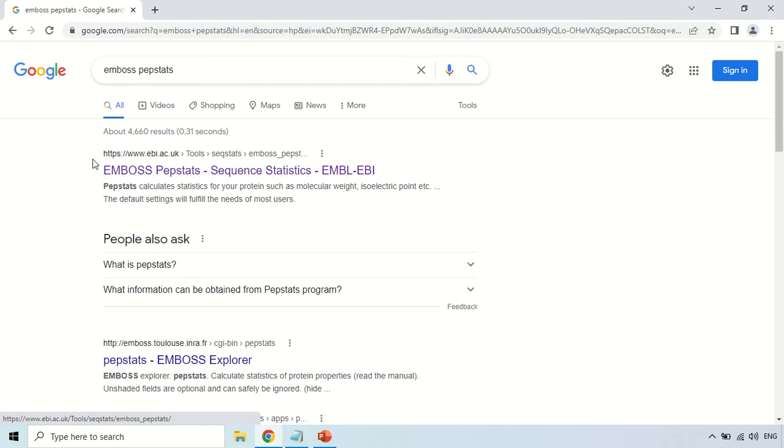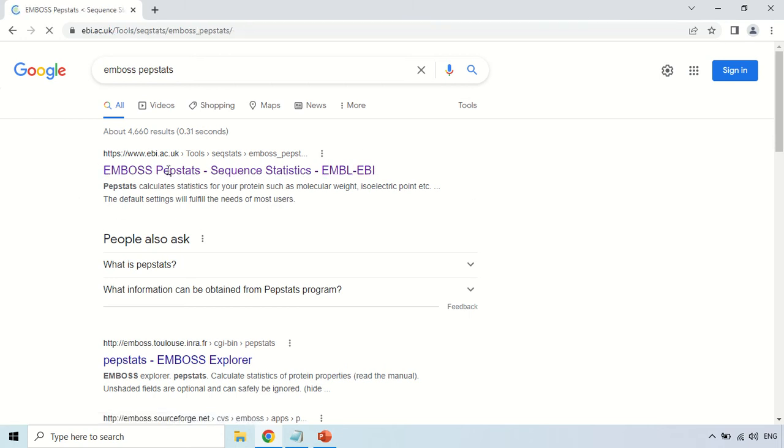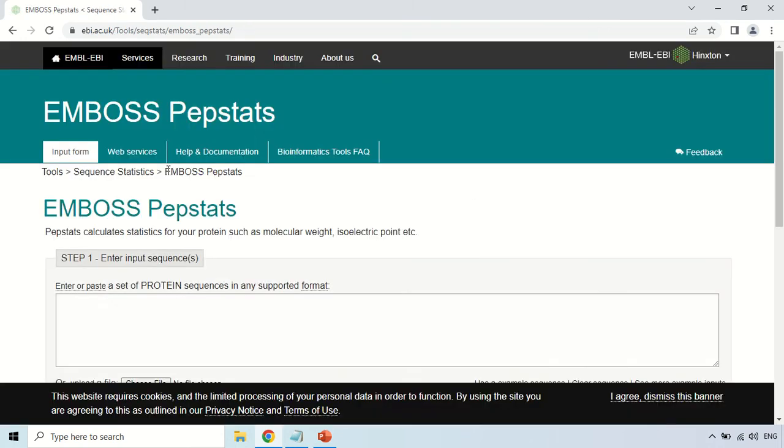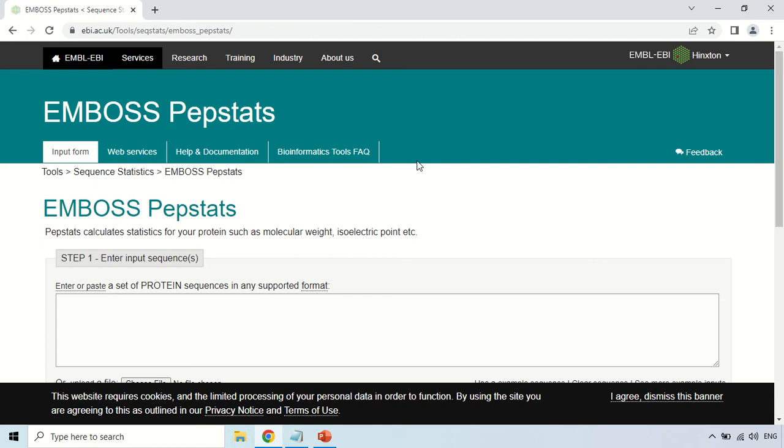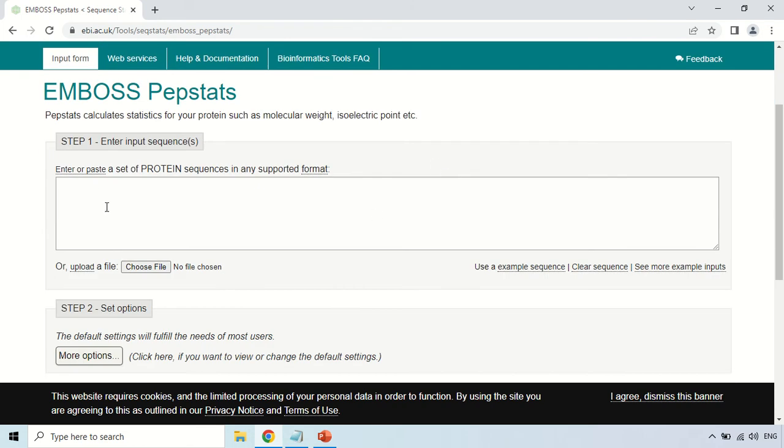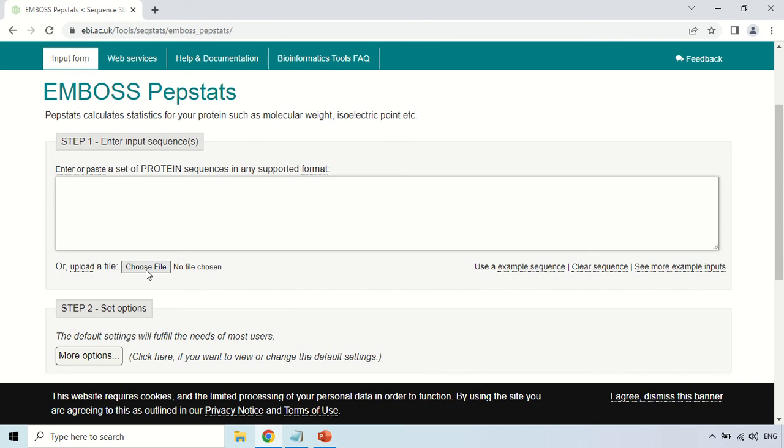Now this is the home page of this tool, EMBOSS PEPSTAT. It is a very simple home page. You just have to enter your sequence here, enter or paste your sequence of which physiological property you want to know. You can either directly choose the file from your system.